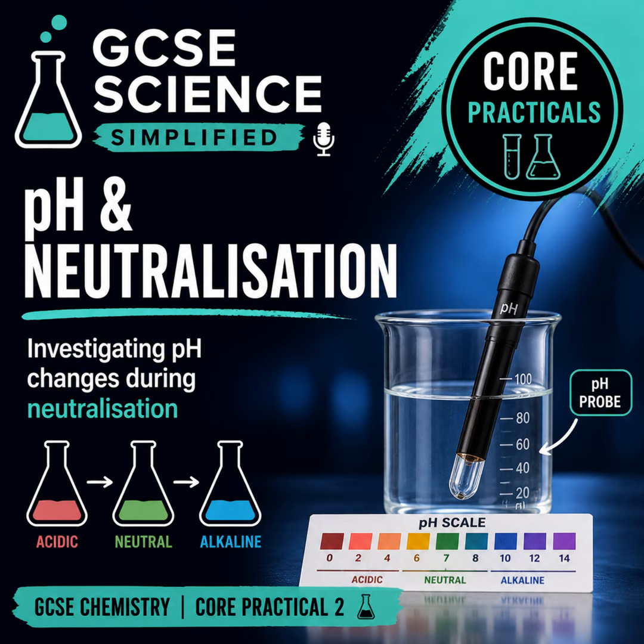There are two main ways to measure pH: using universal indicator, placing it on a white spotting tile and adding a drop of solution using a glass rod, and comparing the change of colour of the universal indicator to a pH chart. Secondly, and more accurately, you could use a pH probe, and this gives you a direct numerical reading.